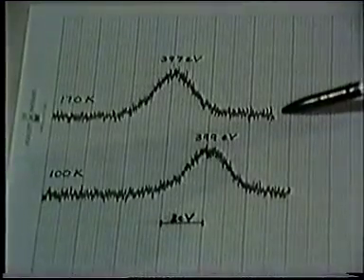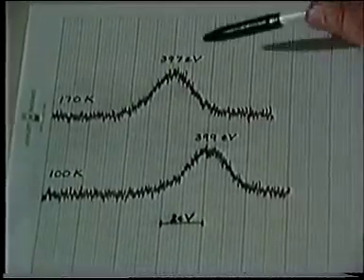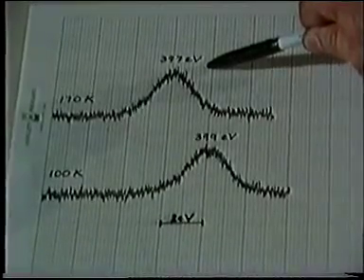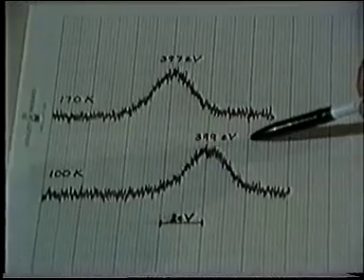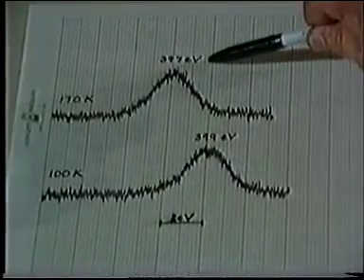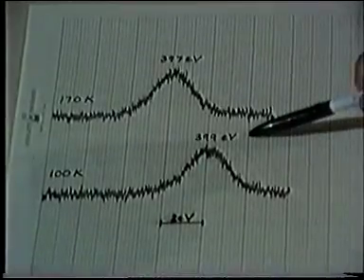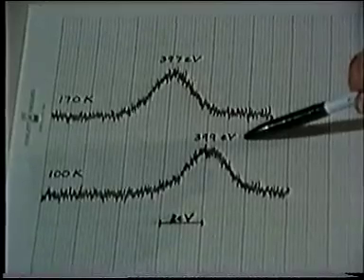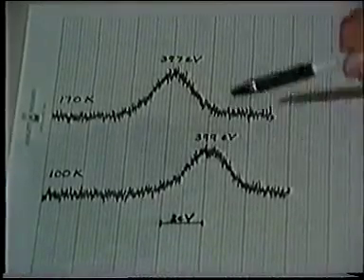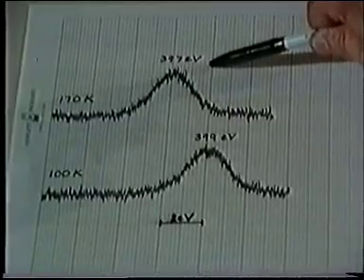This is the spectrum after the surface has been heated to 170 degrees Kelvin. The peak is now at 397 electron volts, not 399. There's been a chemical shift, a change in the adsorbed species. What's the nature of this change? The peak at 399 is probably due to adsorbed dinitrogen. At 170 Kelvin, the species that remains on the surface is clearly not the same.